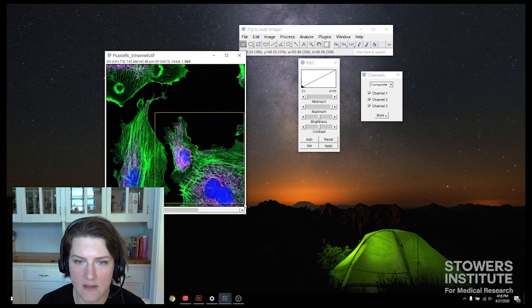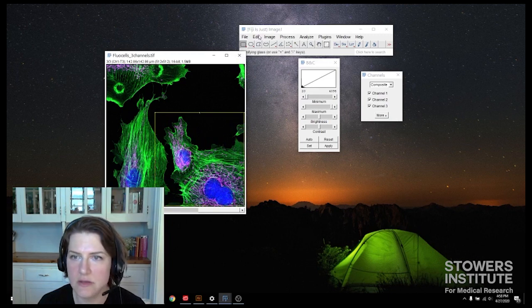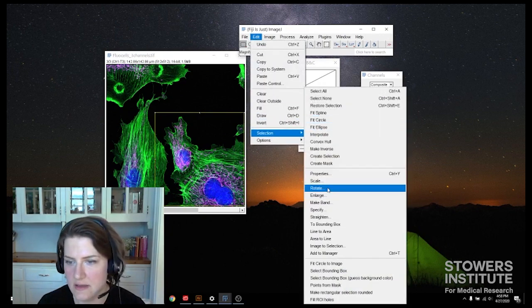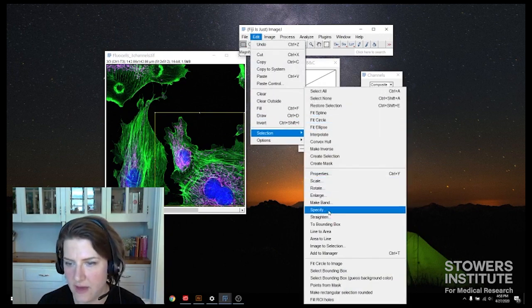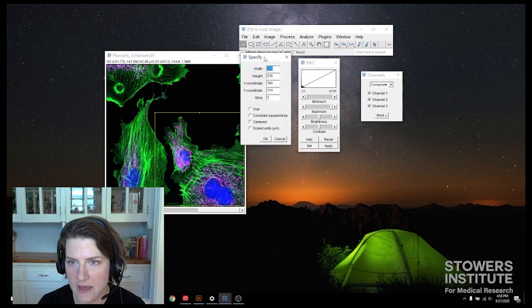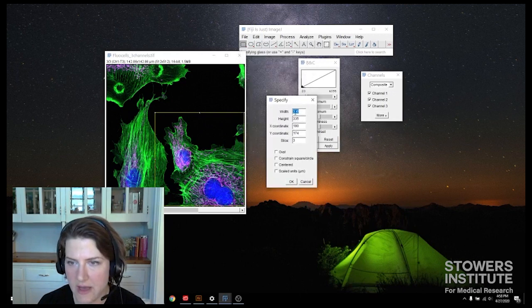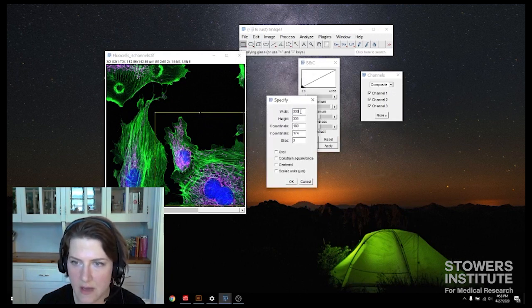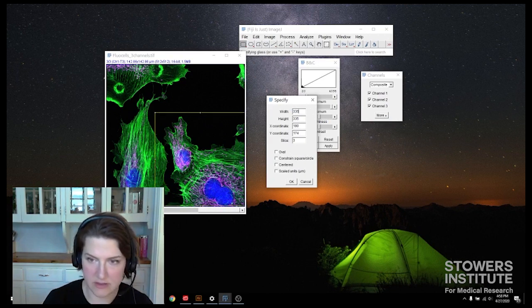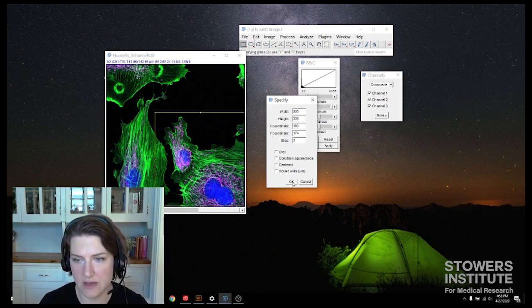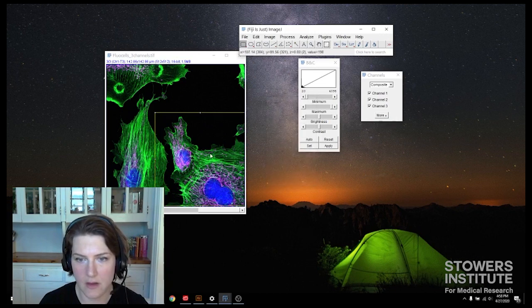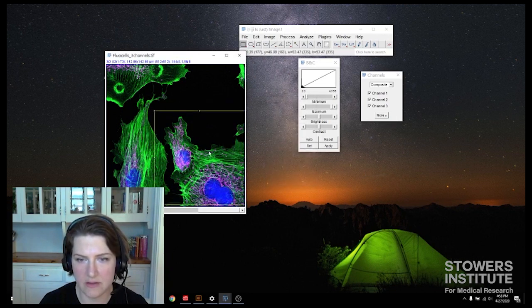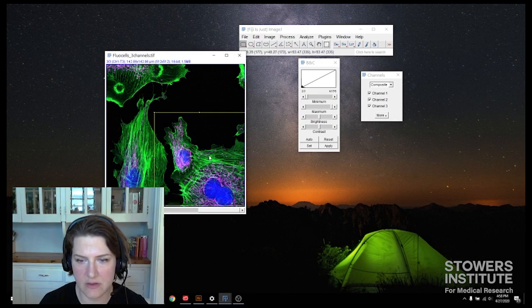And then I'll come up to edit, selection, specify. And then I can see, okay, I made it 330 by 335. That's pretty close to being square. I'm going to change my 330 to a 335 and then we'll be nice and perfectly square. Alright, and then I can click in the center of this and I can move it around so it's exactly where I want it to be.